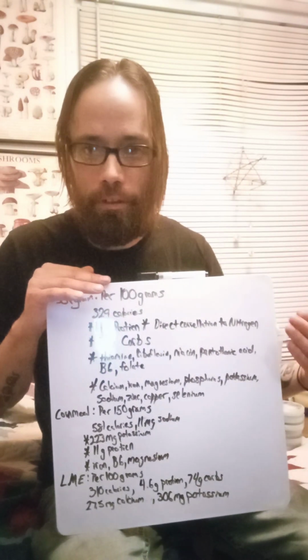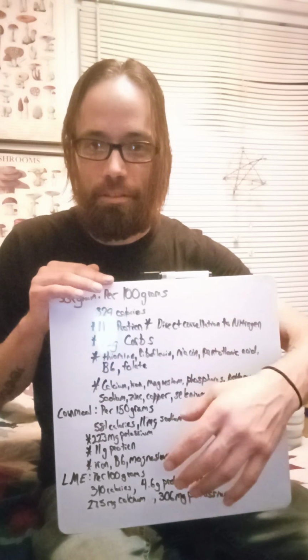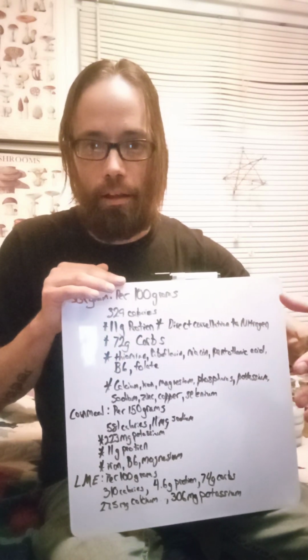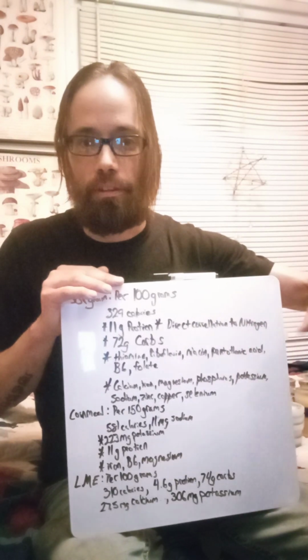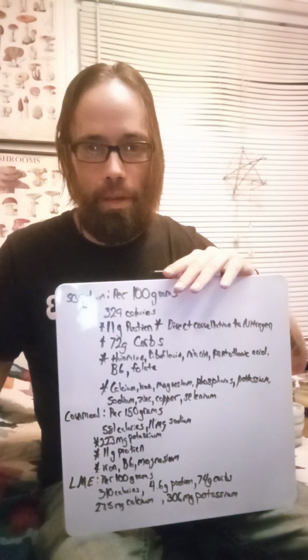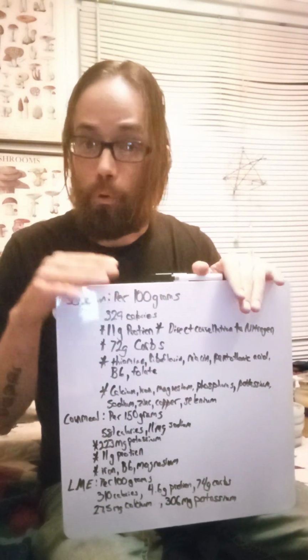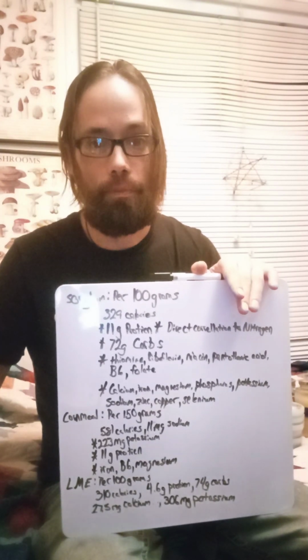I found that, like with the cornmeal, one time I did like 20 plates, one 500 milliliter bottle of that, and then a light malt extract, potato dextrose blend next to it, and I poured like 40 plates of that, and then I had a couple other basic media formulations I had to make up my 100 plates. I always do 5 bottles. I think I talked about this in another video. Pour 20 plates per bottle. Whatever is left after 20 plates stays in that bottle, because I want consistency.